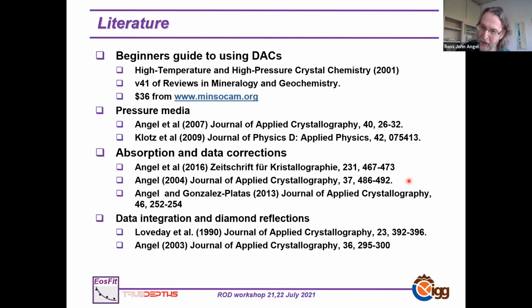It's desperate, but it's much better to collect perfect data, and basically go back and do the data collection again. But I know there are some cases where something funny happens under high pressure and you can't reproduce it. So if that's the only data set that you have, there is the opportunity to correct the data from within Absorb, which is accessible via Chrysalis.